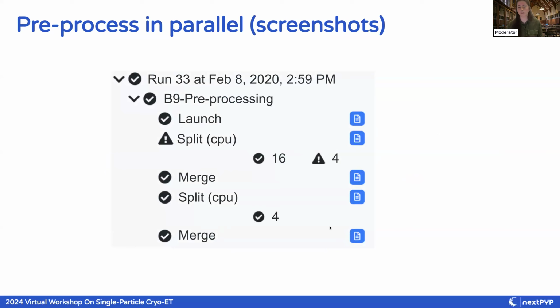That way, if there's something actually wrong with your process, it's not going to keep putting you in this loop endlessly, but it does give it another chance. Say something was wrong with a specific node, odds are when it gets resubmitted, it'll go to a different node, and you might get better luck this time.